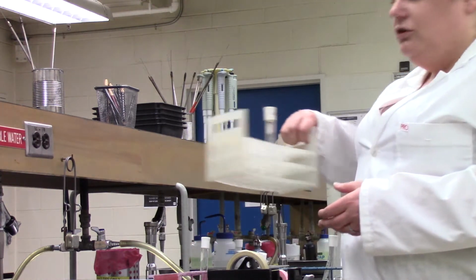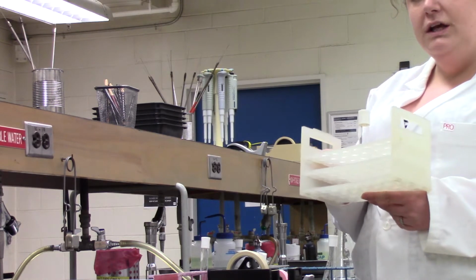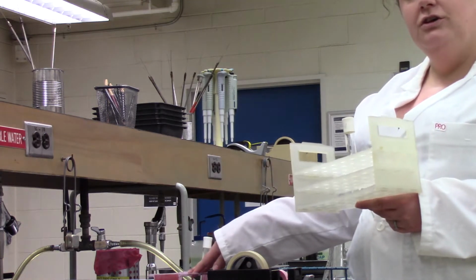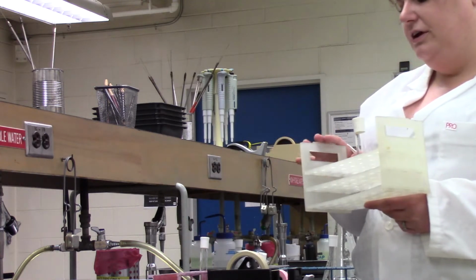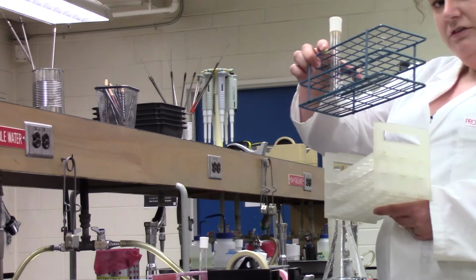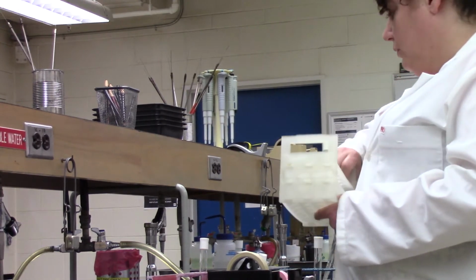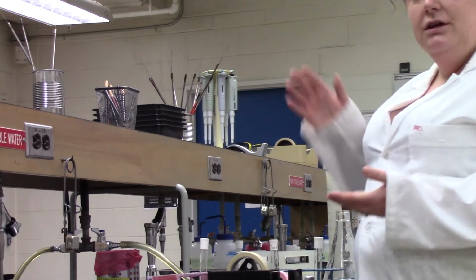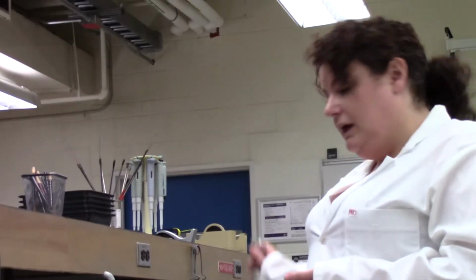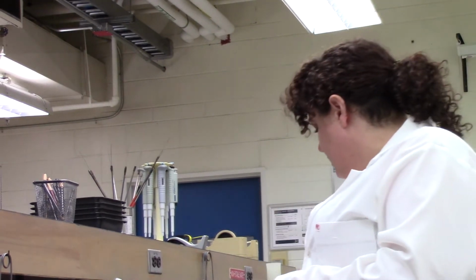We generally don't put these white test tube holders into the autoclave. They are a little bit less resistant than the Nalgene ones. So usually we want to stick with the Nalgene plastic or a metal test tube rack like this one. So metals are something that's totally fine to put into the autoclave. Same with glassware, that would be something that's good to autoclave.